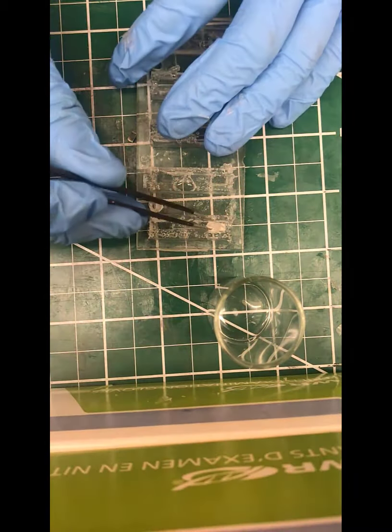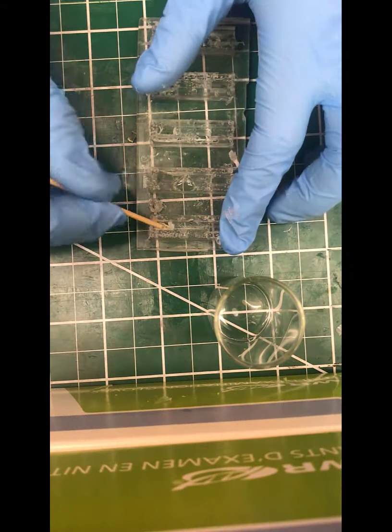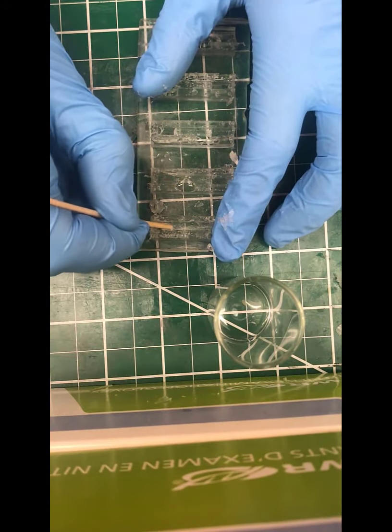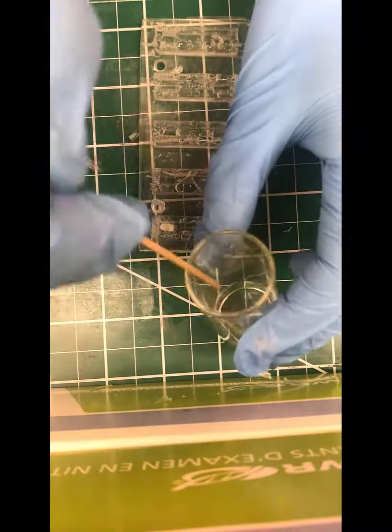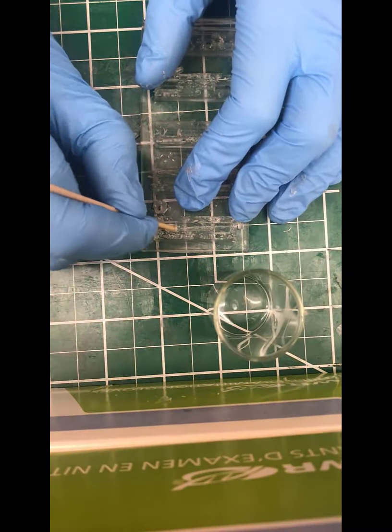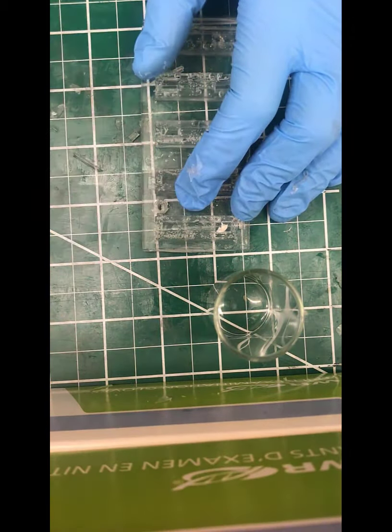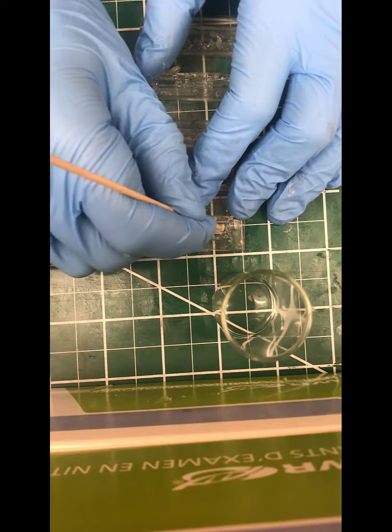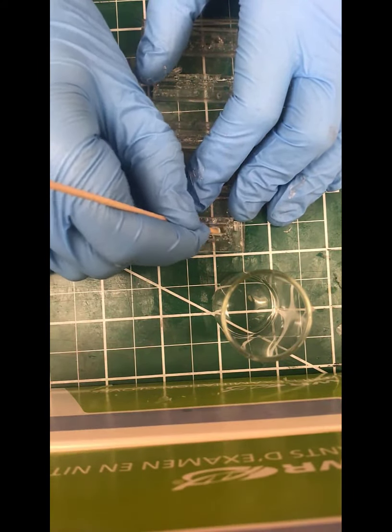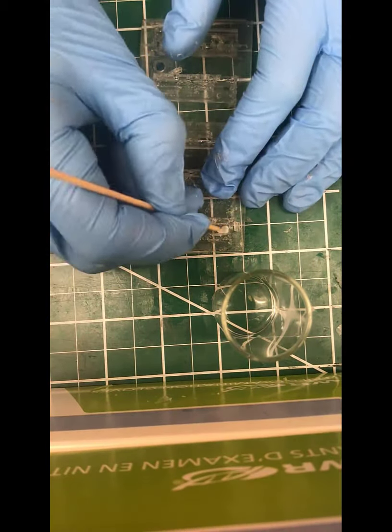One mechanism to do this is to take a wooden dowel and to take a little bit of a kimwipe, dip it in methanol, and then use that to rub it around in the base. I like to break the dowel just to effect a sharper point. You'll see that later in the video. So you really want to scrub this thoroughly. If there's any bit of grease there, you won't make contact because the grease will block the water from actually making contact to the FTO and your device won't work. So this is a crucial step where you're going to want to spend a little bit more time again to get this nice and cleaned up.